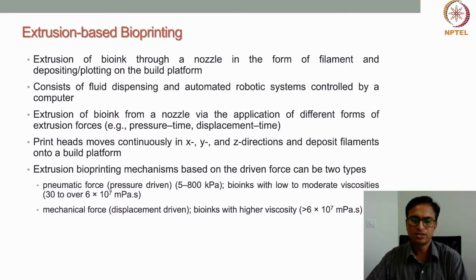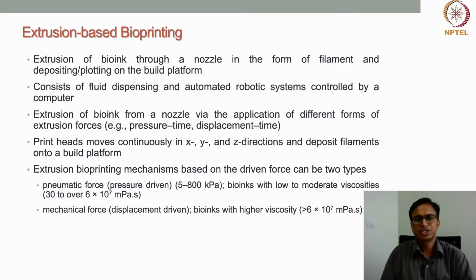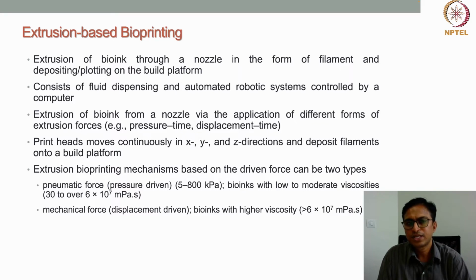In this technology, we extrude a material through a syringe using a pneumatic pressure or mechanical pressure in the form of a filament, and then deposit or plot that extruded material on the build platform as per the design. The bioprinter consists of a fluid dispensing system and also an automated robotic system controlled by the computer. The fluid dispensing system takes care of the extrusion of materials.